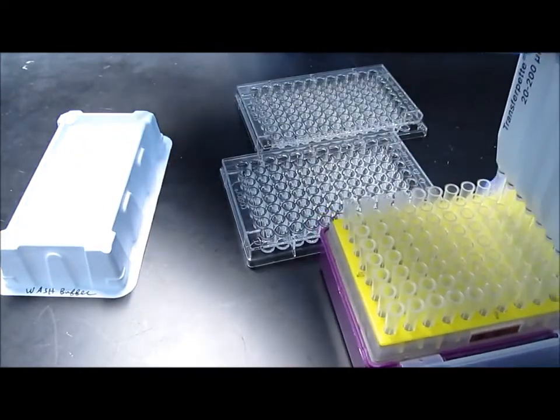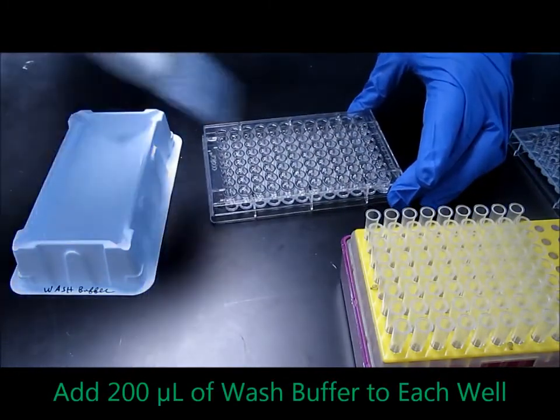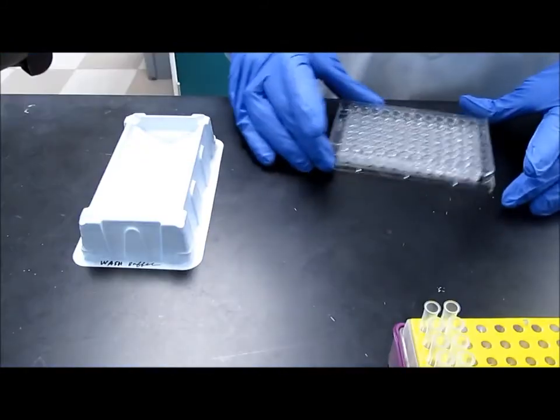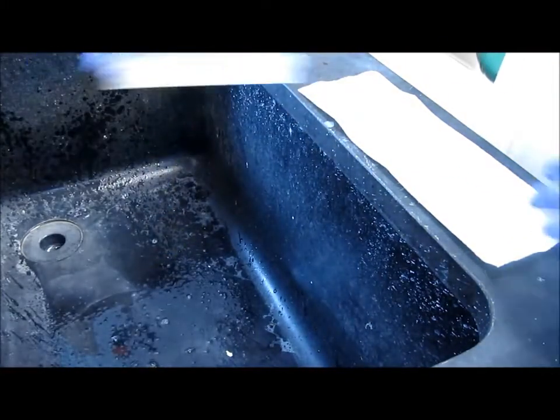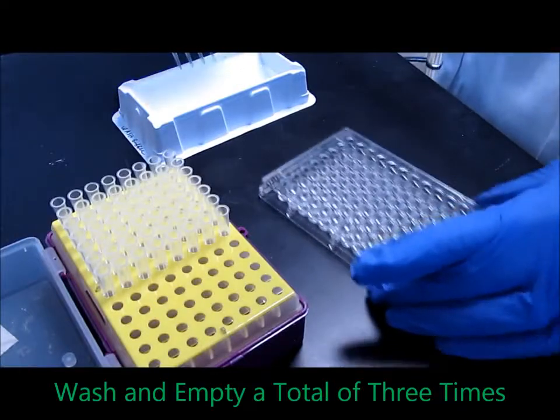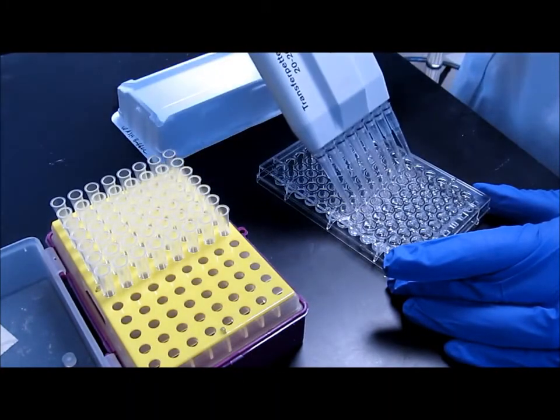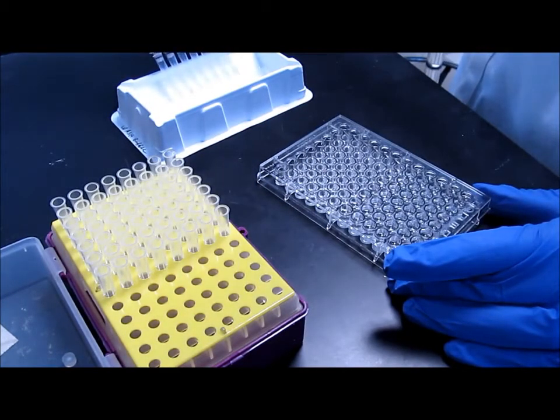Then take your multi-channel micropipetter, set it to 200 microliters, and start pipetting the wash buffer into each well of the ELISA plate. 200 microliters should be more than sufficient to fill up the plate. Once you're done pipetting, I like to give the plate a gentle tap to make sure everything's mixed, and then repeat the emptying step, fill the plate, and empty and fill and empty. You're going to do this a total of 3 times in order to make sure that you've removed any residual capture antibody from the well. This process of washing and emptying is going to be repeated throughout the ELISA. So from now on, we're not going to be showing you, we're just going to be telling you that you have to wash after this.